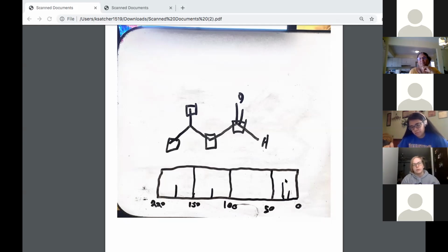Can you do this spectrum with any kind of compound? Yes. Organic, you mean? Yes, any organic compound, as long as it has carbons, because it's carbon-based. And any carbon compound will have, from mass spec, we learned that it'll have 1.1% of carbon-13 mixed.